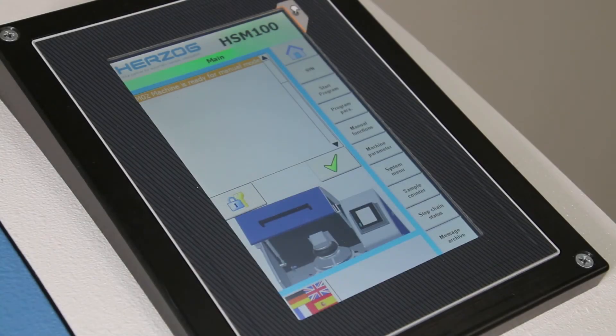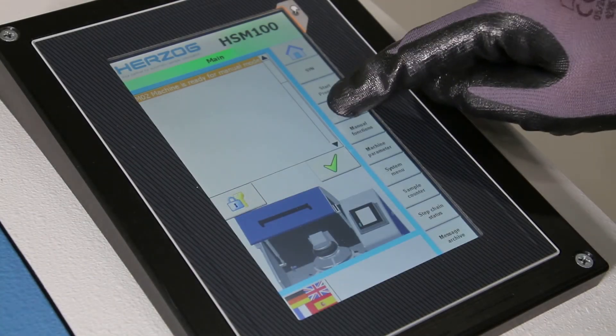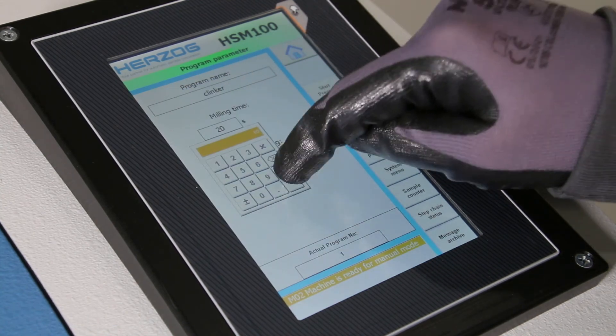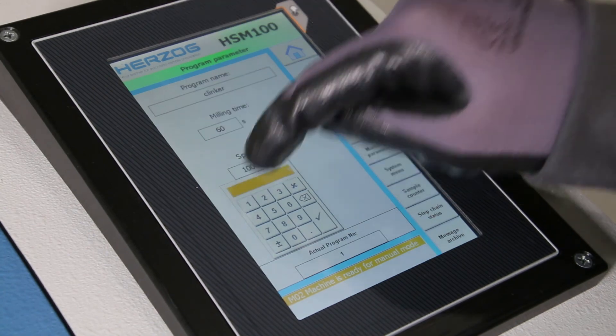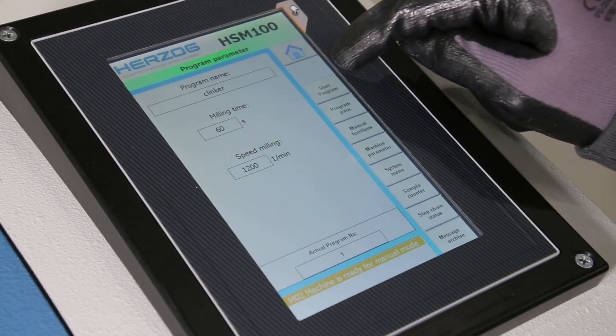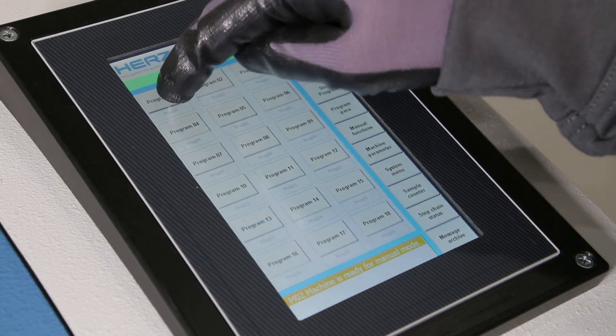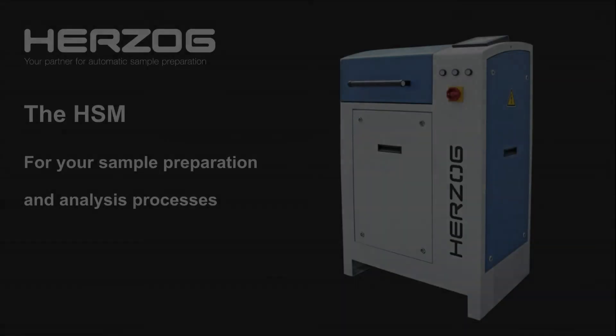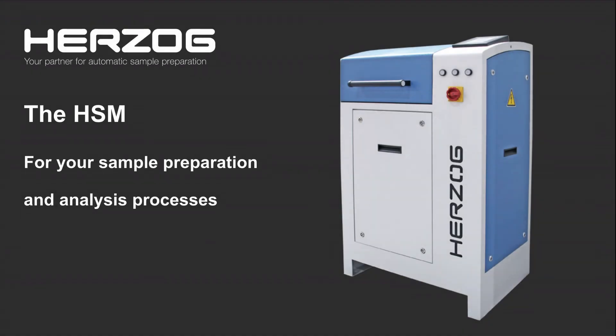The integrated touch-sensitive color panel enables easy setting and saving of grinding parameters and programs. Moreover, the operator has an overview of the machine's status and milling progress at all times, making laboratory work even more efficient. This turns the HSM into an indispensable part of your sample preparation and analysis processes.